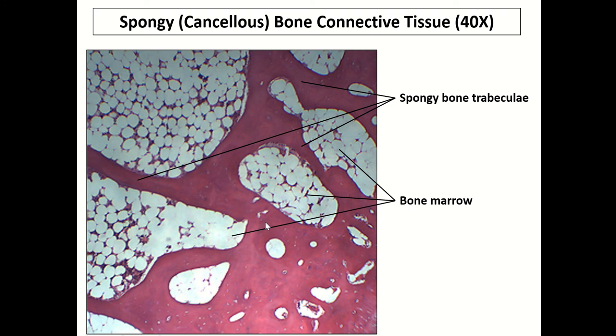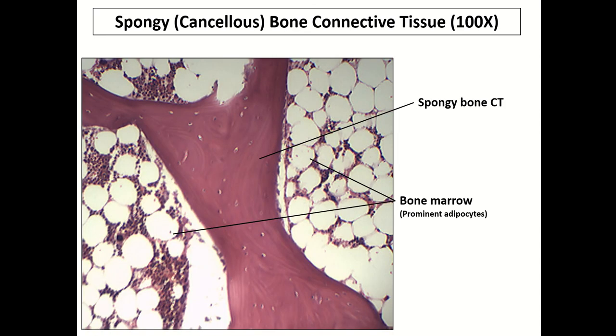And these are basically formed as collagen fibers pack pretty tightly together around bone cells. So if we zoom in and take a closer look at that, these trabeculae right here actually look a little bit like cartilage. And that's because there are actually regions of bone in the body that are formed directly from cartilage. It's not true in all cases, but they have a lot of similarities. And so you can see those similarities here when you look at this tissue. Here's the regions of bone marrow around that. And you'll notice, of course, there's some adipocytes that are present within the bone marrow.